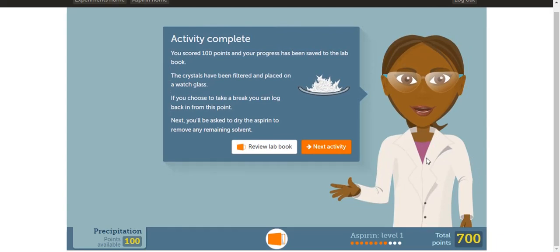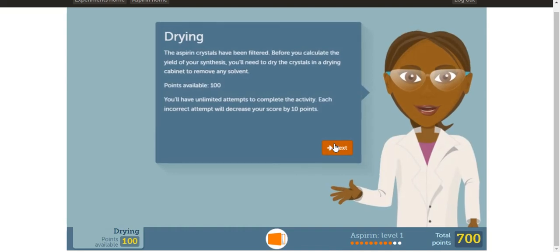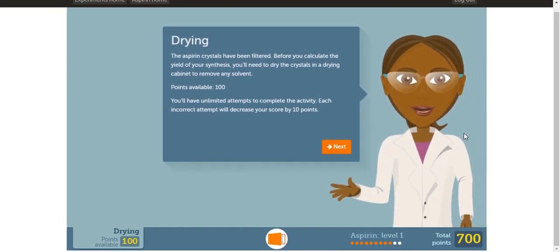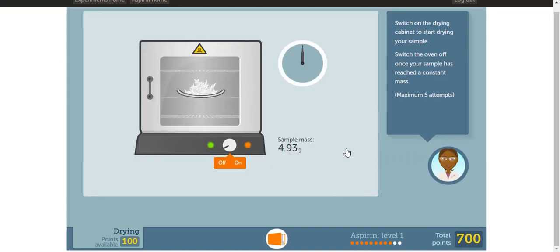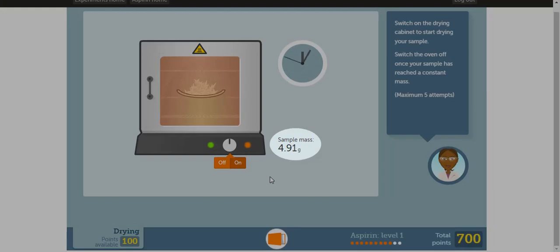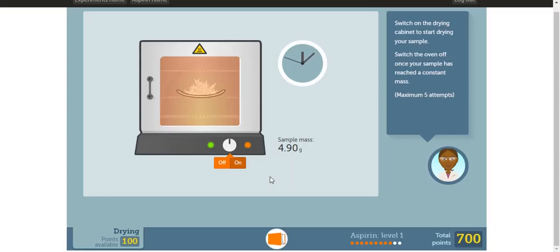In the next activity, we have filtered the crystals and collected them in a watch glass. Now we're going to dry the aspirin to remove any remaining solvent. Keep in mind, if you make a mistake, your score will decrease by 10 points. To dry the aspirin, turn on the oven — click the on button. Leave the oven on until the sample mass is constant. Once the sample mass is constant, turn off the oven. Then click check.